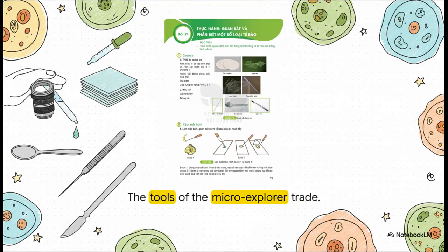You know, you really don't need some massive, multi-million-dollar facility to do real biology. With just a handful of simple tools, we can safely prep our specimens. We're talking flat glass slides, incredibly delicate little cover slips, some absorbent filter paper, a dropper, dissecting needles, a spoon, and a scalpel. Honestly, these basic instruments are all you need to unlock the cellular world.